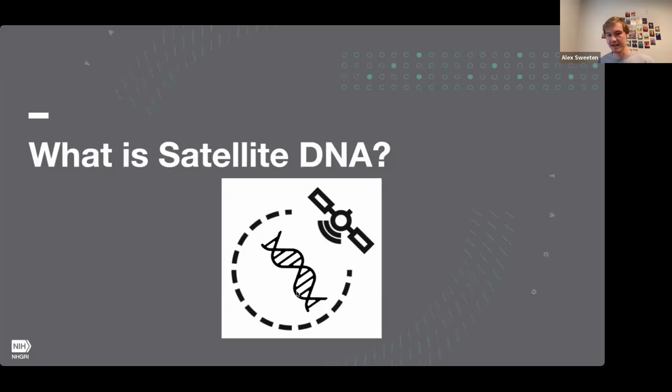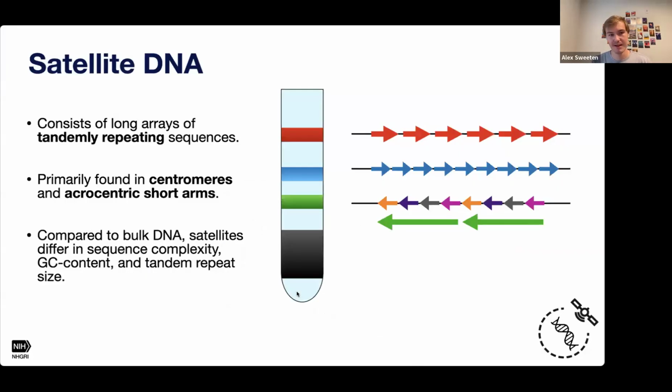And so satellite DNA is maybe a term you're not too familiar with, just because in reference genomes, there hasn't been large satellites that we've been able to see before. So you might not know what it is. Simply put, satellite DNA consists of tandemly repeating sequences.